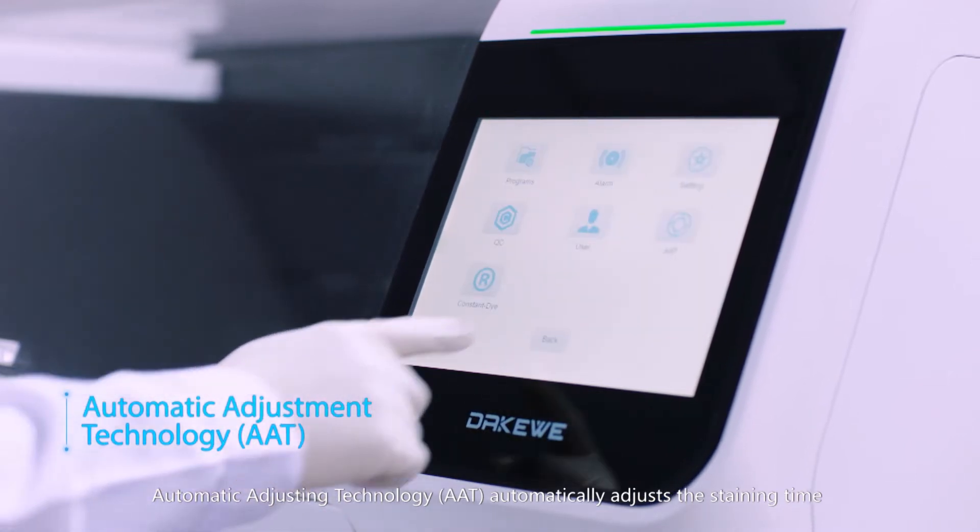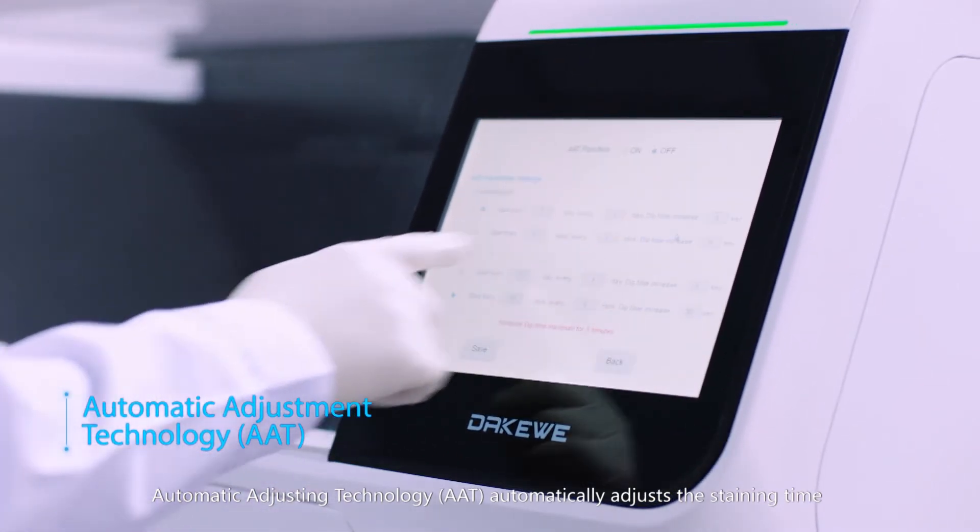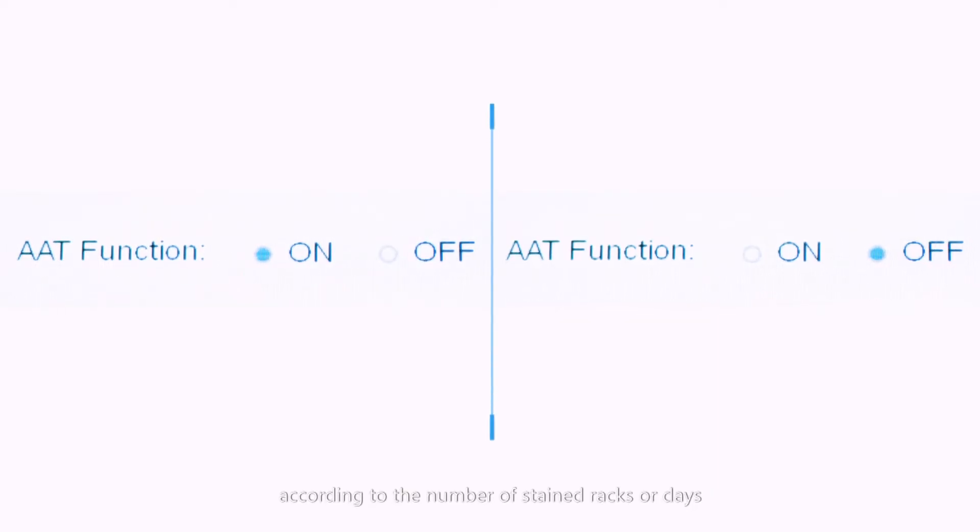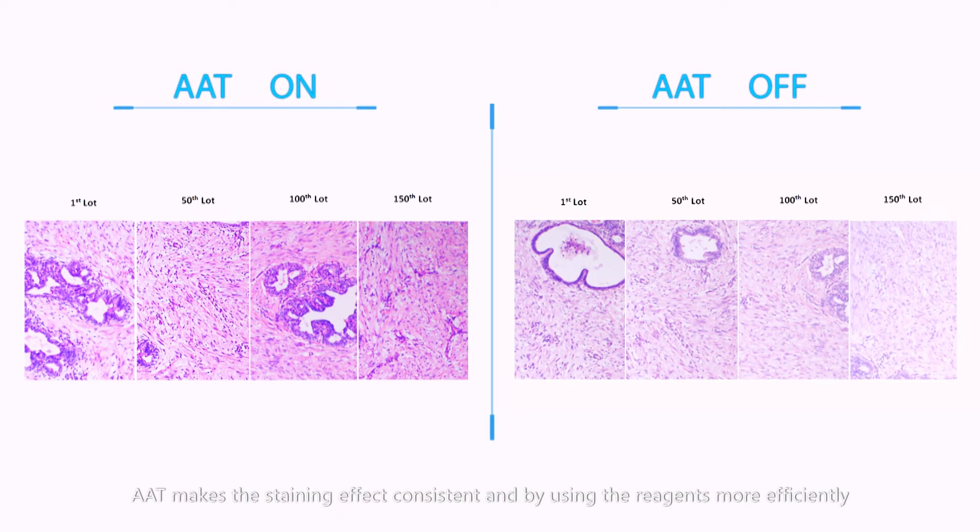Automatic Adjusting Technology, AAT, automatically adjusts the staining time according to the number of stained racks or days. AAT makes the staining effect consistent by using the reagents more efficiently and helps to save reagent costs.